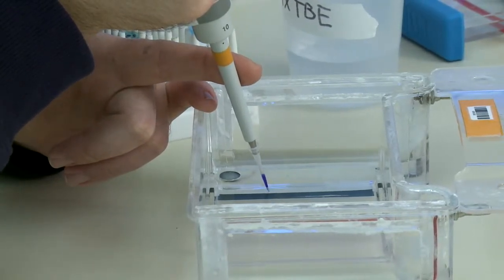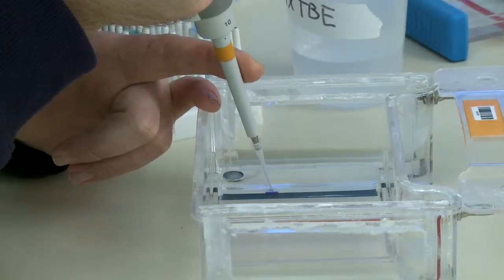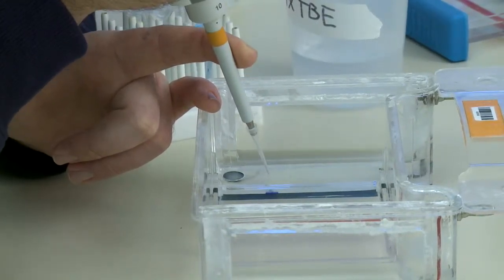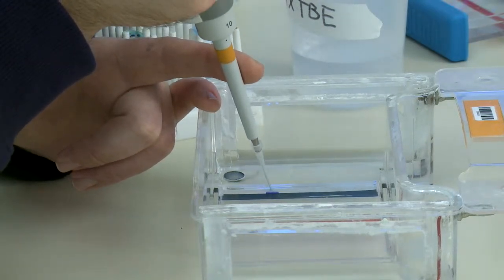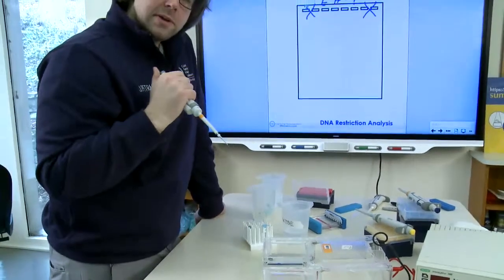So I'm going to go into the well, and I'm going to go to my first stop only when I dispense the sample, when I push out the sample. The reason for that is because if I go to the second stop, I'm also going to push a little bit of extra air in there, which is going to throw off the position of the sample. It's going to blow it out of the well, or it might anyway. All right. So once I'm done with that, I keep my thumb on the plunger on the end of the pipette, and then I can let go once I'm clear of the gel.